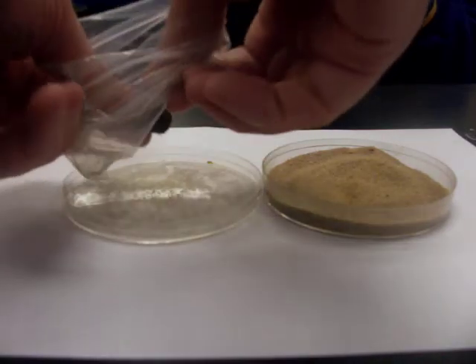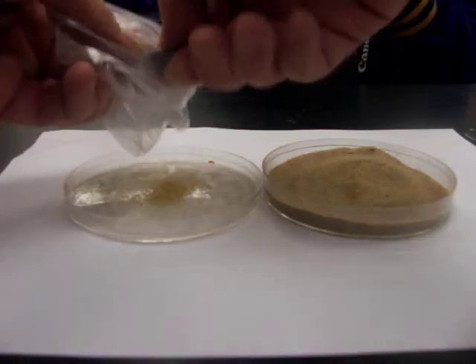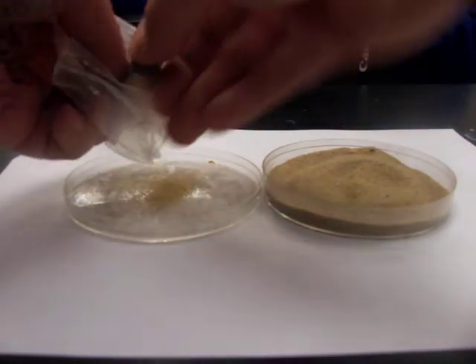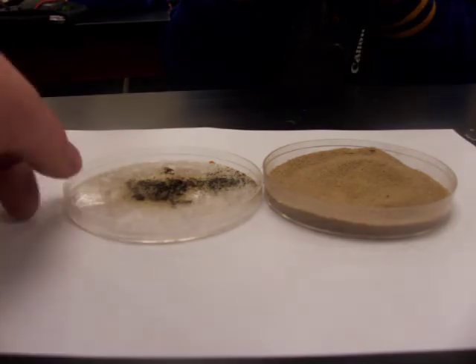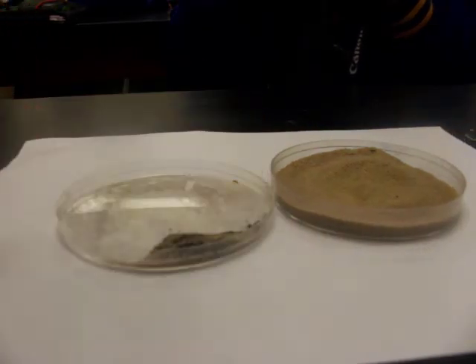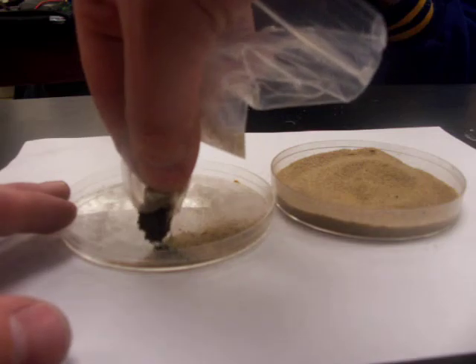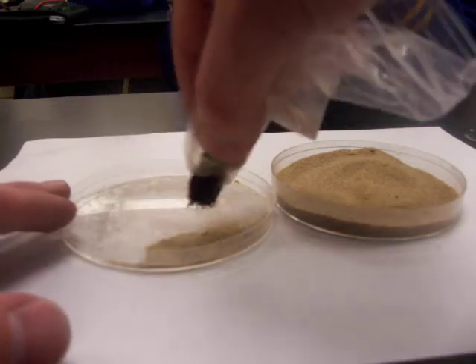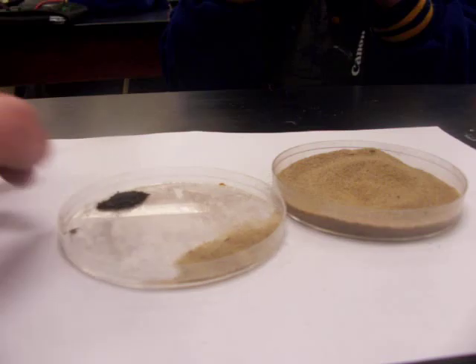Then all we have to do is remove the magnet and we have a pile of iron left. At this point there is some sand mixed in with the iron, and we can go through a refining process where we repeat what we just did with the iron we've pulled out. Each time we're able to get more pure iron out, until we're left with just a pile of iron.